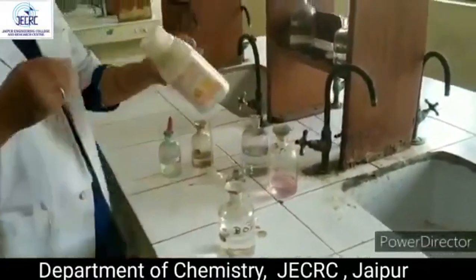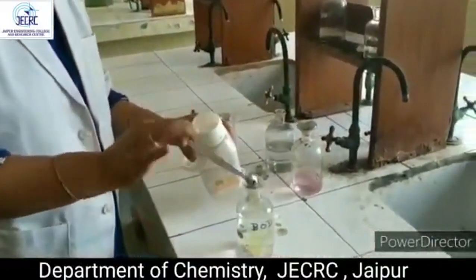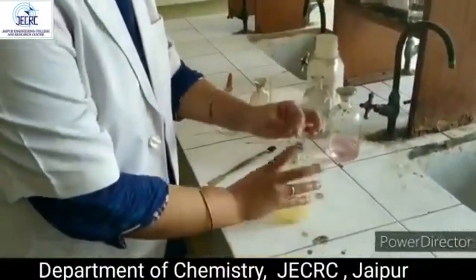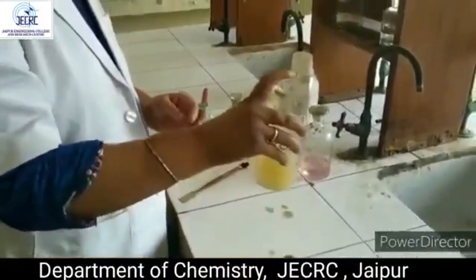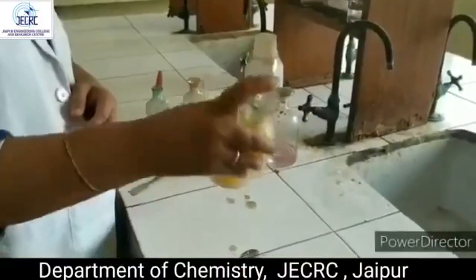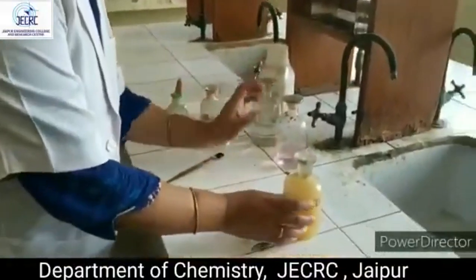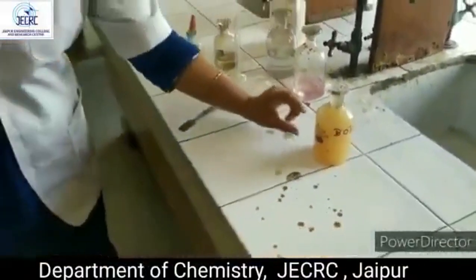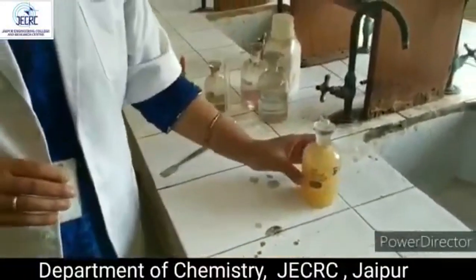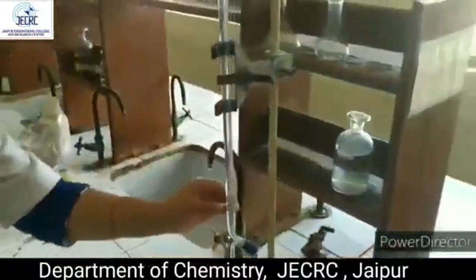Now we will add NaOH pellets, 4 to 5 pellets, and then the reaction starts. We'll close this BOD bottle and shake it well, up and down, so that the proper reaction takes place. Now the precipitate starts forming, and as the precipitate settles down, we'll do the titration with this hypo solution which we have taken in the burette.